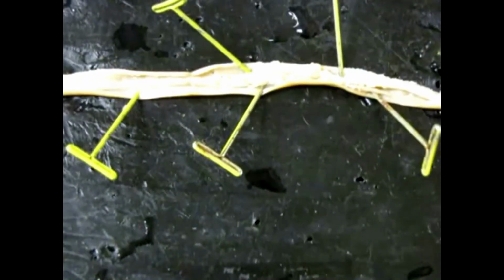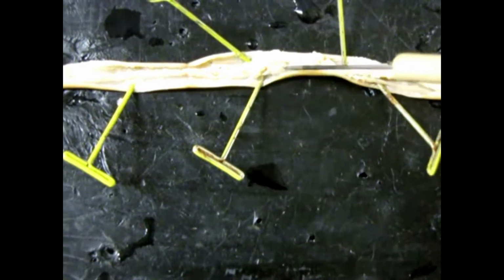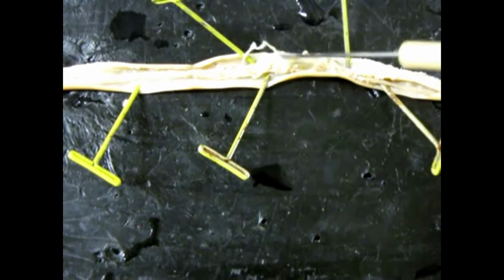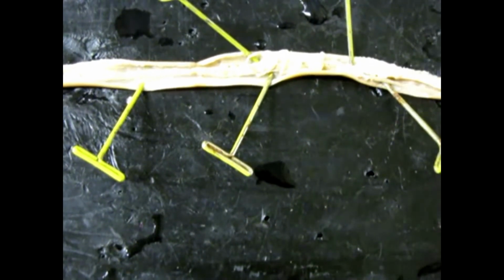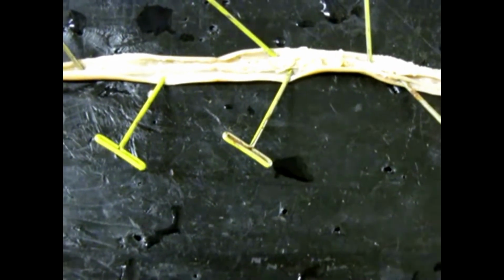And then again we can see a series of these coiled little tubes all throughout in here, very fine, and those are the vas deferens and the testes. Again, it's very hard to distinguish the testes because they're quite small, but as in the female, the sperm are produced in the testes, pass through the vas deferens, and then out through the seminal vesicle.